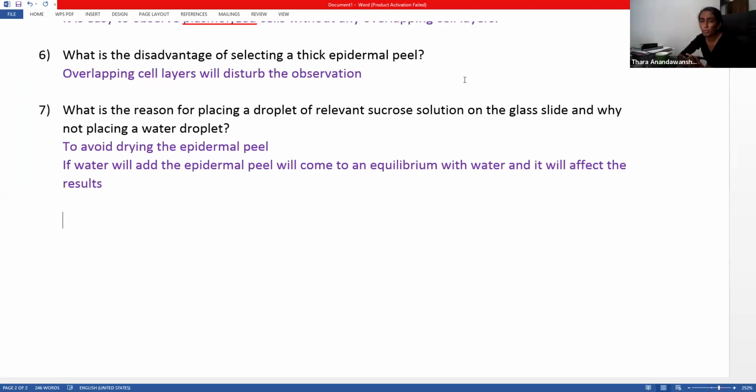And then what should you do? Adjust the light and make sure enough light is coming through the objective lens. Then you will be focusing using which focus? Coarse adjustment, the rough focusing knob. And then you take a clear field and turn it to mid power according to the practical. With mid power, which adjustment knob? Fine adjustment knob. And then you will be making it more clear.